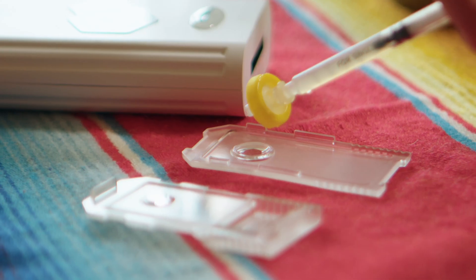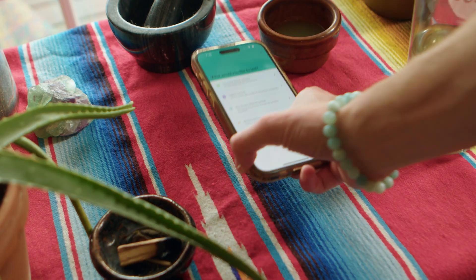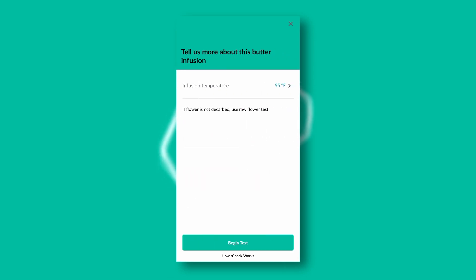But how does it work? Simply add your cannabis sample and reagent to the device, and in just a few steps, you'll have precise potency readings at your fingertips. Let's take a closer look at some of the key features of the T-Check 3. With its intuitive app and customizable settings, the T-Check 3 offers unparalleled convenience and flexibility.